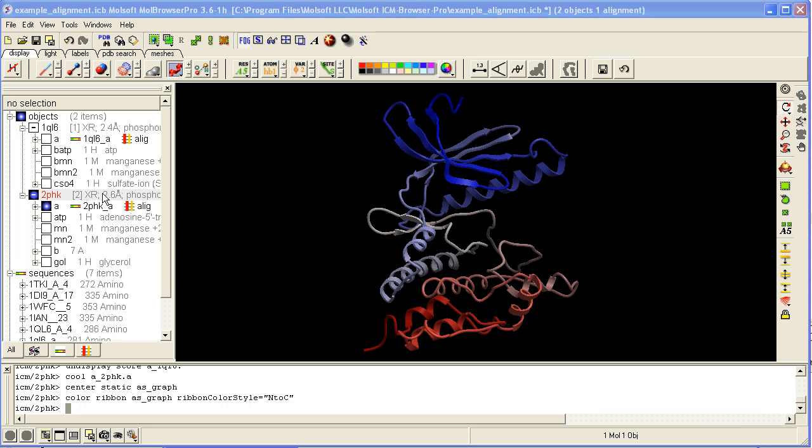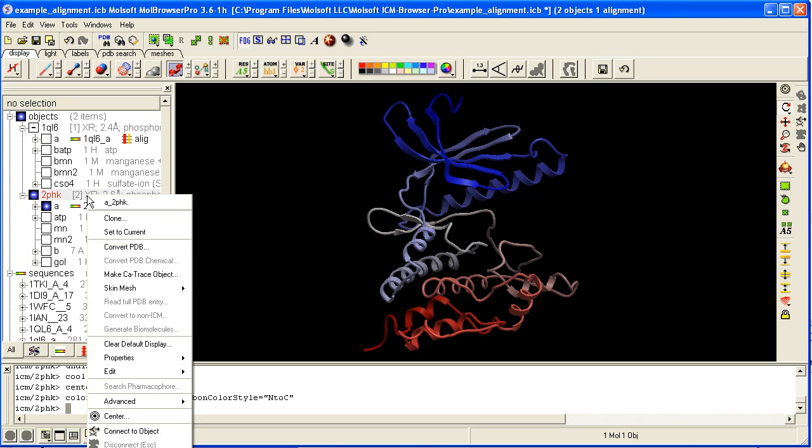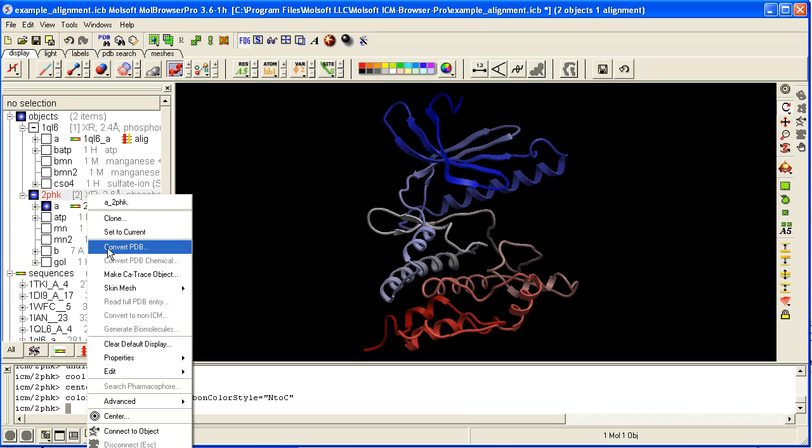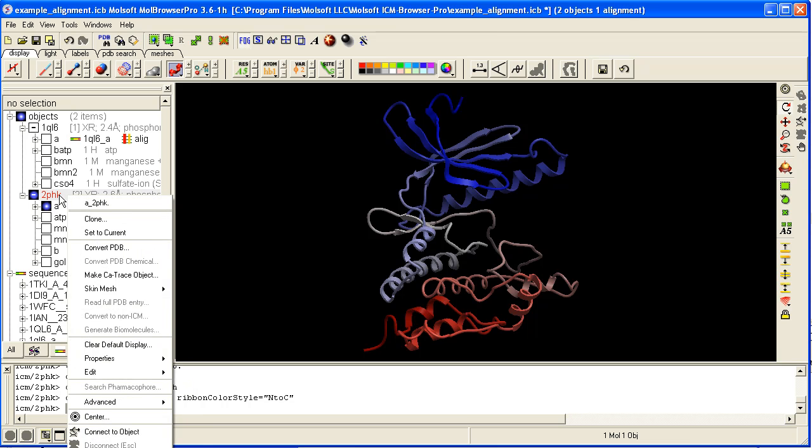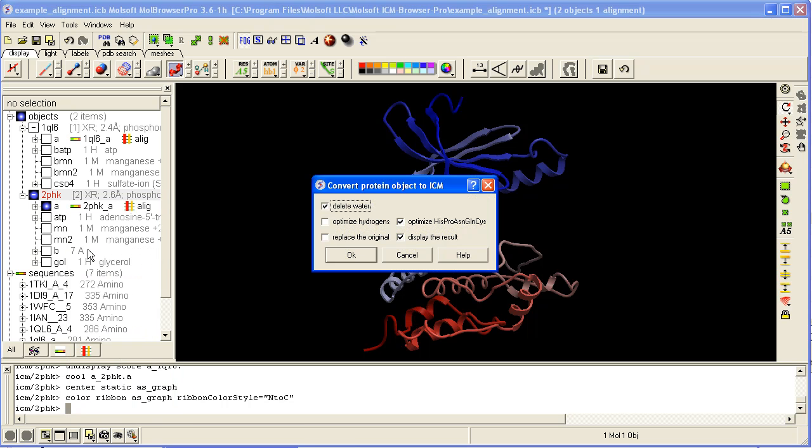To convert it to an ICM object so you can do energy calculations, hydrogen bonds, and things like that, right-click on the name of the object and select convert PDB.